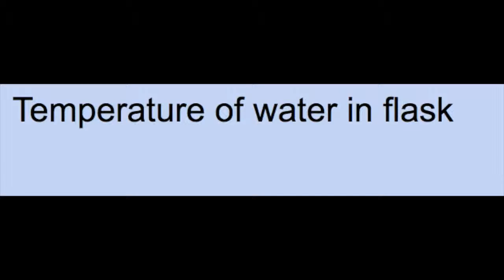For our chemistry concoctions project, we tested the temperature of the center flask in the lab. The research question we developed and tested was, does an increase in the temperature of the water in the center flask change the volume of water that ends up in the graduated cylinder? We later developed a hypothesis surrounding that research question as well.